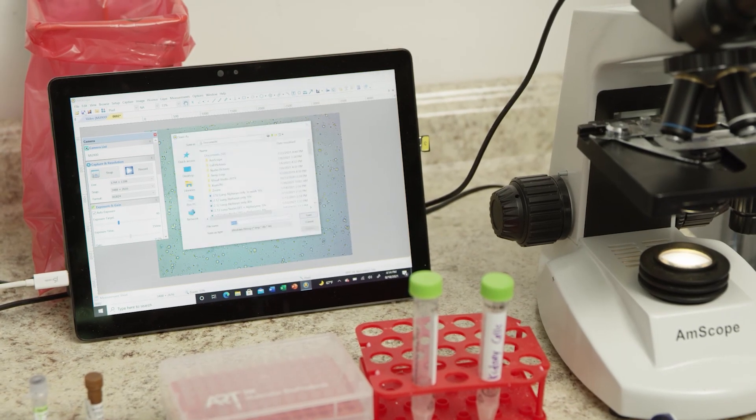This completes the process for using the Singulator. Additional steps may be needed to further purify the cell suspension for your applications.